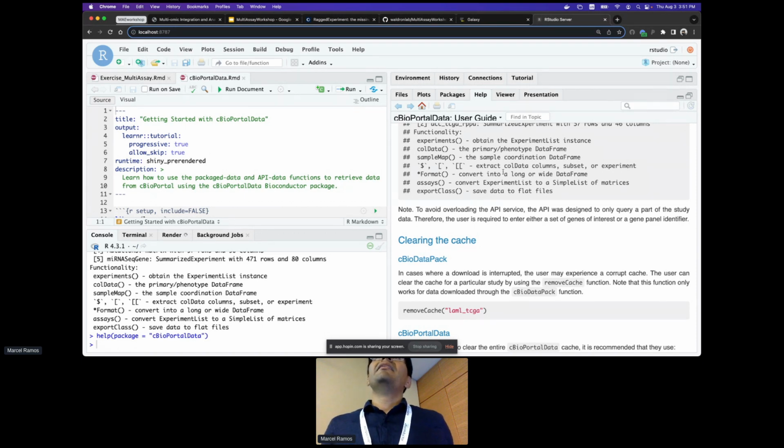Right. You can put it in there, but you'd have to sort of access it manually and bring it out.